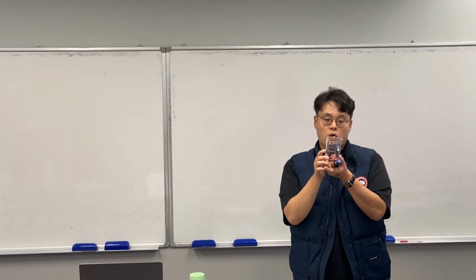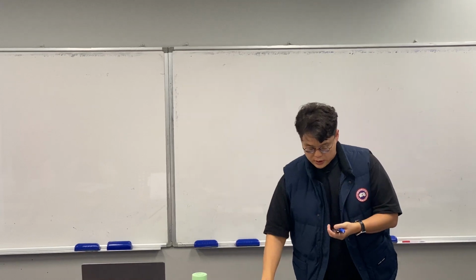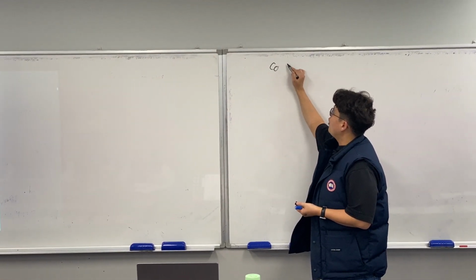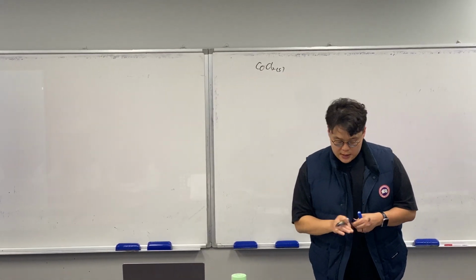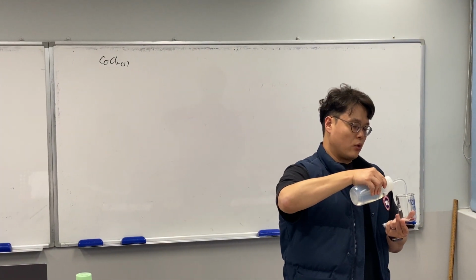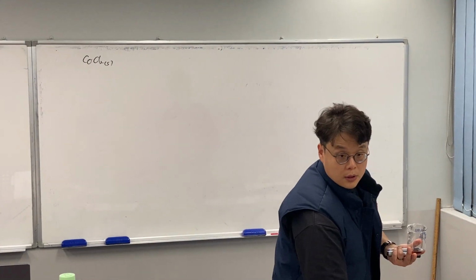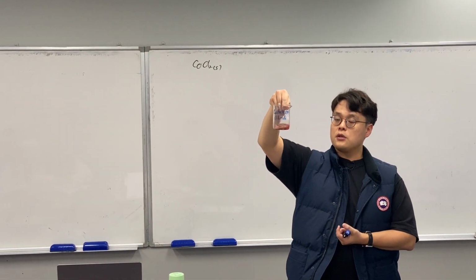This is giving you some cobalt(II) chloride in terms of the solid state. So let's give you some example here. We have cobalt(II) chloride, CoCl2 solid. Now, as I am adding some water here, this comes in solid state. Let's put some water in here. I'm making this now called hydrated. Do you remember the term hydrated salt? Something we learned, and it's showing you the colors of this.